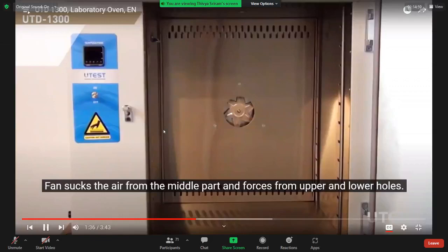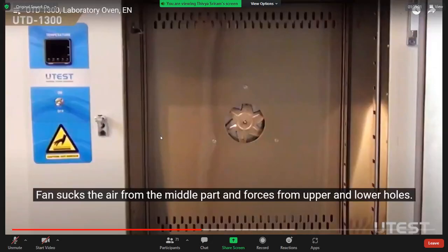Here in the oven, the convectional heat will be spread inside the oven. Before placing the sample inside the oven, we have to place the trays inside the oven. After that, we have to set the optimum temperature which we want to use, and we can also set the time as well as the temperature which we want to use in the oven.